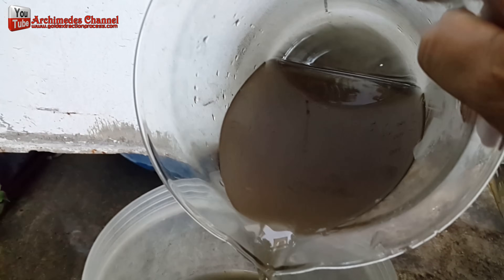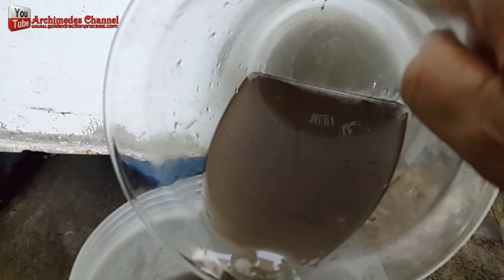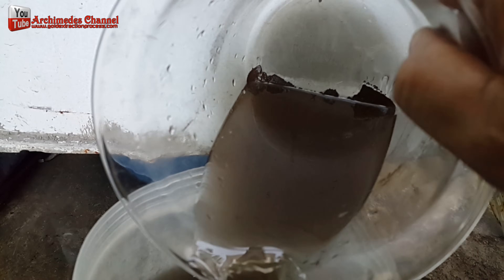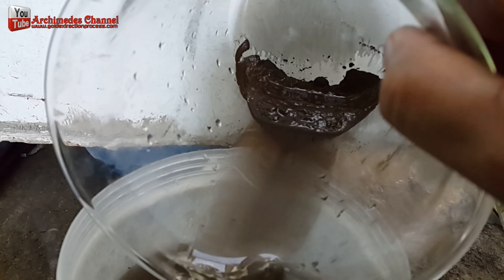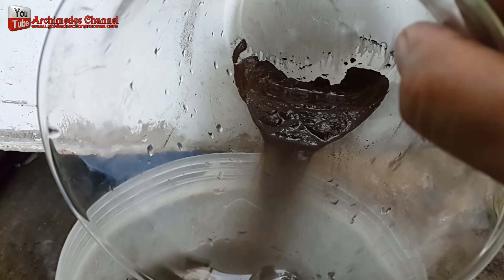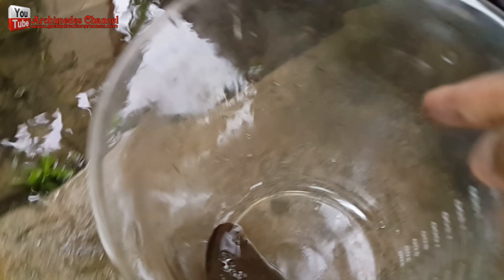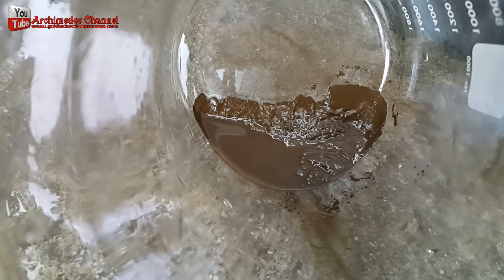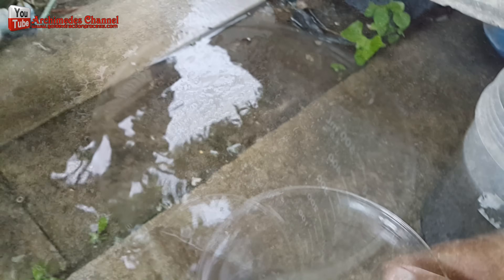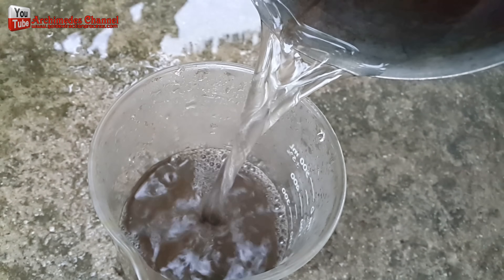I slowly poured out the chemical solution, ensuring the sediment remained. Soaking the gold sediment in hot water, I rinsed it three times to remove any chemical residue.